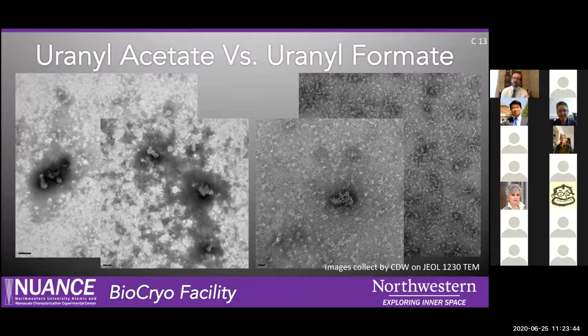I was really having some challenges with the sample. The client had some very strong expectations of what he should be able to resolve from it. When using uranyl acetate, I was finding the sample and I could get some sample sizes, but I could not resolve these smaller details that he was looking for. You can see on the right that uranyl formate really was worth that extra step, going through that process that you have to do for using it.